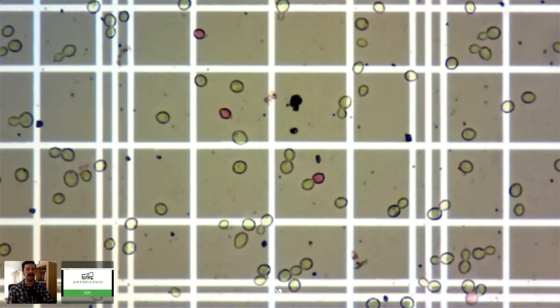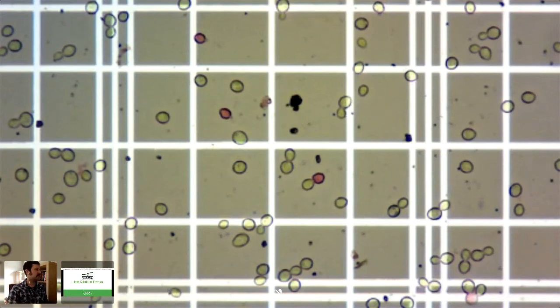What you need to do is let it sit there so that the dye can do its work. The nice thing about Trypan Blue, which we don't use anymore because it's really bad for the environment and people, and erythrosin B, is that the dyes work almost instantly. So by the time you're done homogenizing everything, you can load it onto your chamber right away. That's the nice thing about working with these. And again, erythrosin B is just a food stain, so it's also a lot safer to work with, and it's safer to dispose of. So that is the dilution demo.